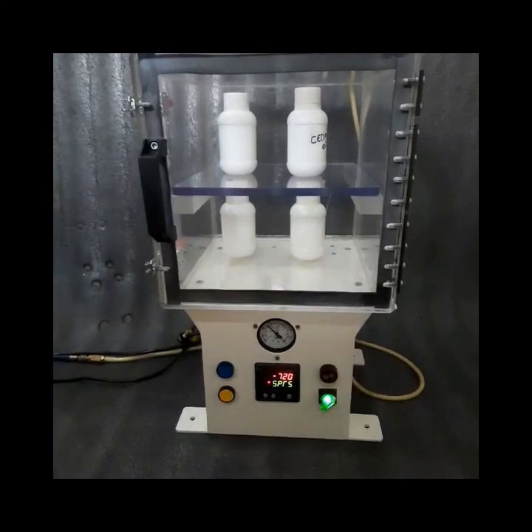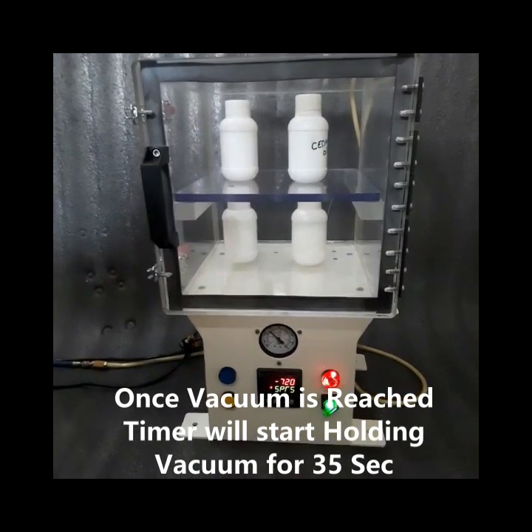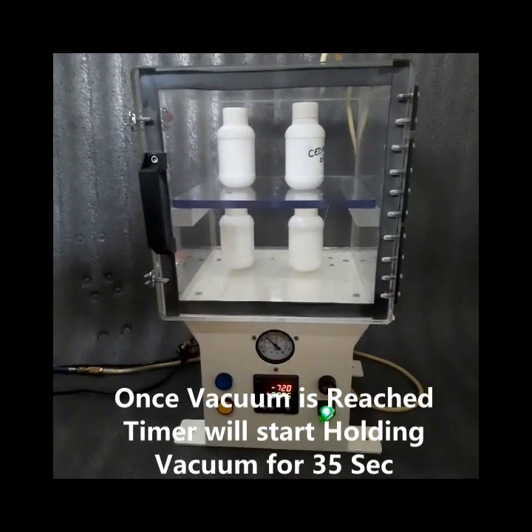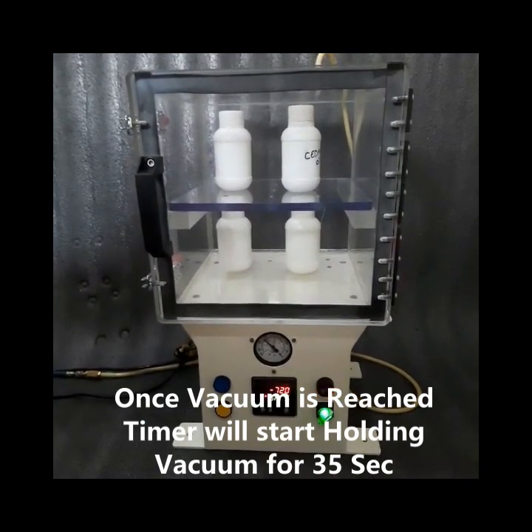The process is now done. We have achieved our target vacuum of minus 720 mbar and the timer has started. It will hold the vacuum for 35 seconds before exhaust.